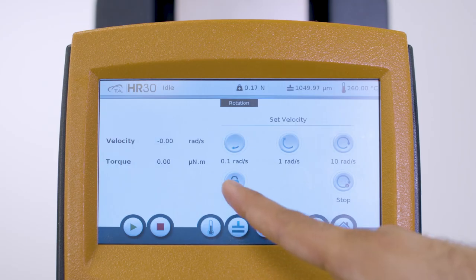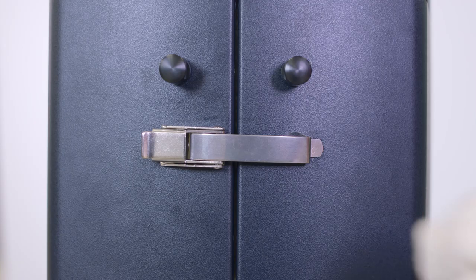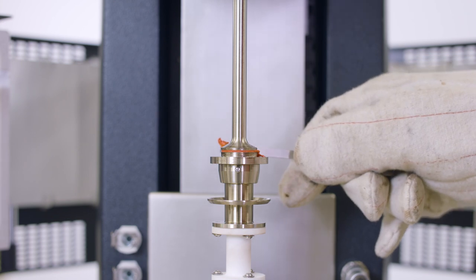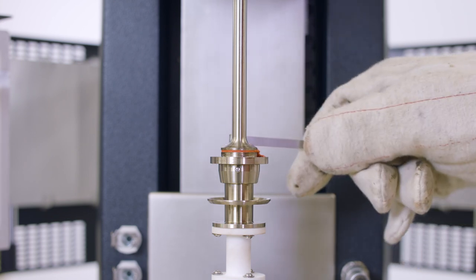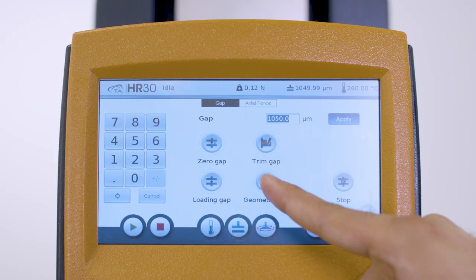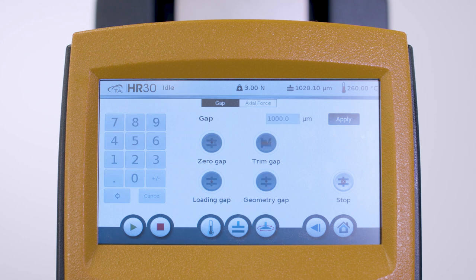Lock the geometry using the touchscreen and open the oven. Use the trimming tool to trim the excess amount of sample from the edge of the 25 millimeter plate. Close the oven immediately. Set the gap to the final measurement gap. Now you are ready to perform the melt rheology experiments.